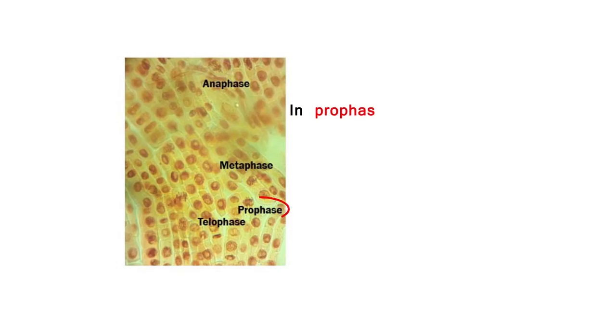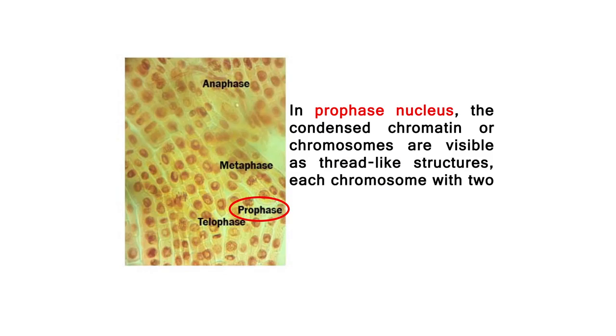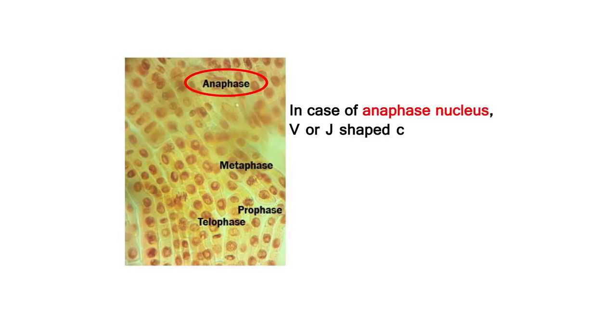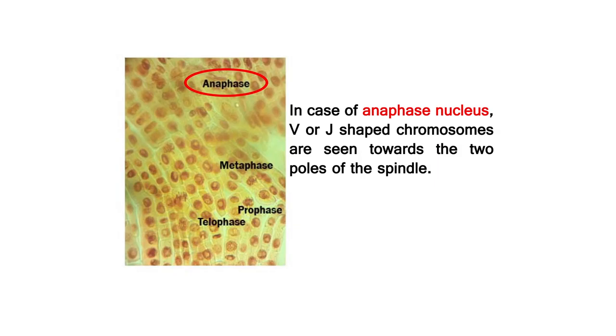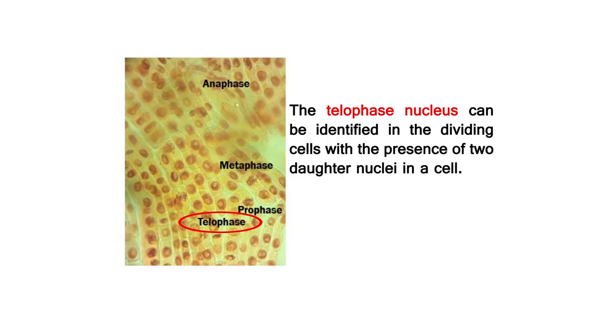Let us now see the results. Large and distinct nuclei with distinct nuclear membrane and nucleolus of the dividing onion root tip cells are visible. In the interphase nuclei, the chromatin networks are not distinguishable into chromosomes. In prophase nuclei, the condensed chromatin or chromosomes are visible as thread-like structures, each chromosome with two sister chromatids. In metaphase nuclei, the chromosomes are seen to lie in a line on the equator of the spindle. In anaphase nuclei, V- or J-shaped chromosomes are seen towards the two poles of the spindle. The telophase nucleus can be identified in the dividing cells with the presence of two daughter nuclei in a cell.